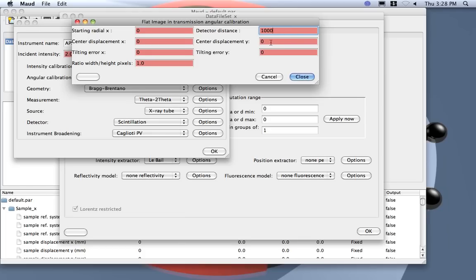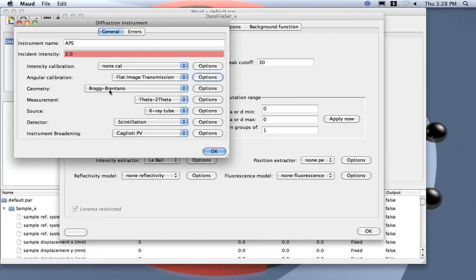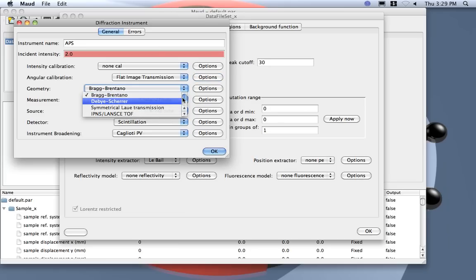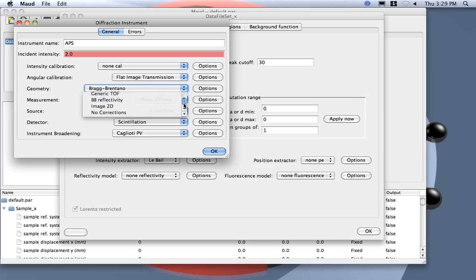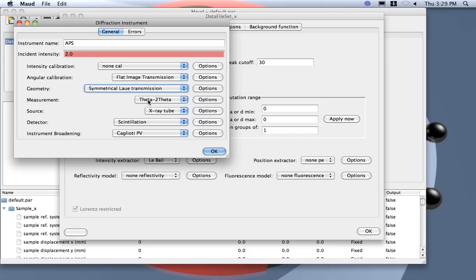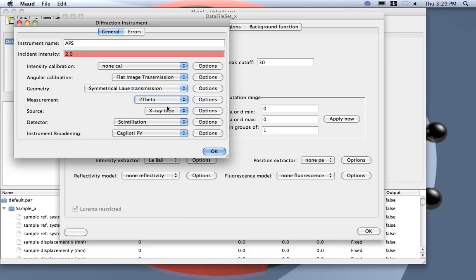Okay, so I suppose the center displacement everything zero. Now here the geometry I can put the symmetrical lower transmission or image 2D, they are nearly the same. So let's use the symmetrical lower transmission. The measurement actually is only 2 theta. This is important, we do not move the sample, it's not a theta to theta measurement.